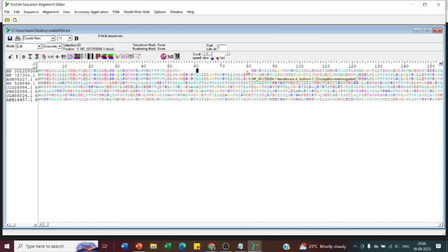We will insert gaps here. We can grab the sequence for different sequence editing. I am not talking about a phylogenetic tree or anything, just sequence editing. For nucleotide sequences you can try the similarity button, so that you can find wherever the changes occurred, which is helpful when you are studying mutation.